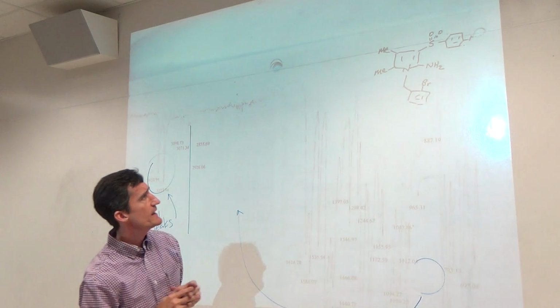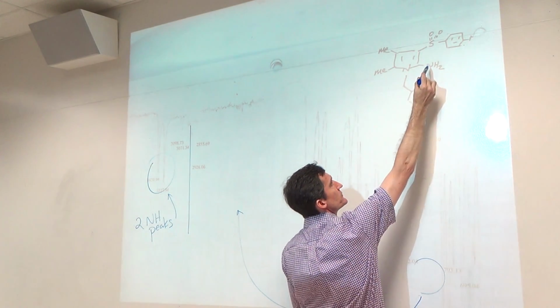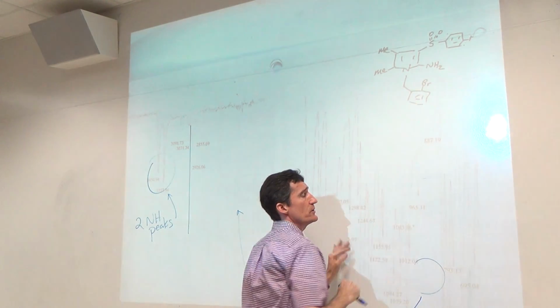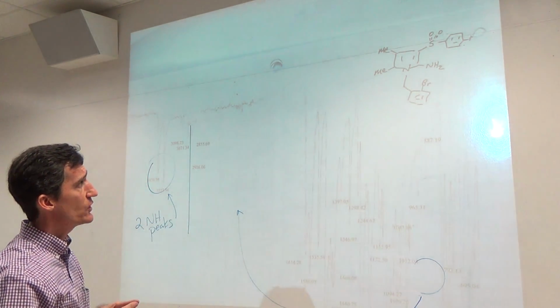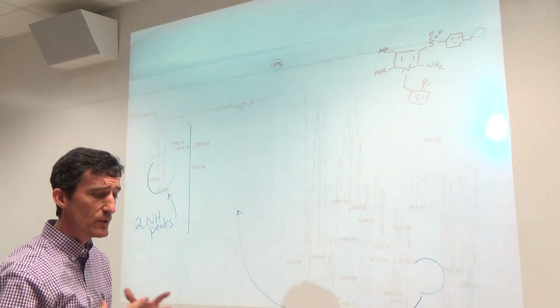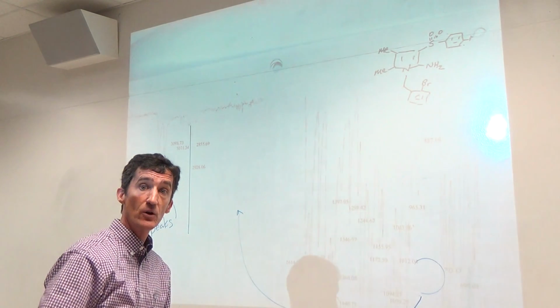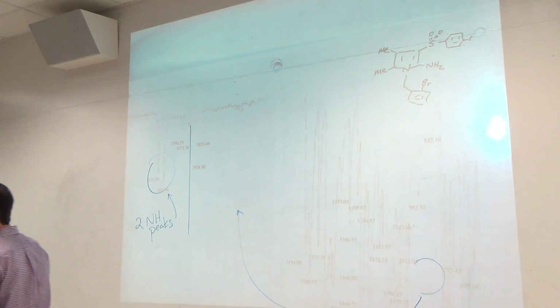This compound was made, and in the next step, what we wanted to do is we wanted this nitrogen to bond to this carbon here and to displace the bromine. And so we did the reaction, we isolated a product, and then what we did at that point is we ran the IR of the product. When we did that, let me show you what we got.